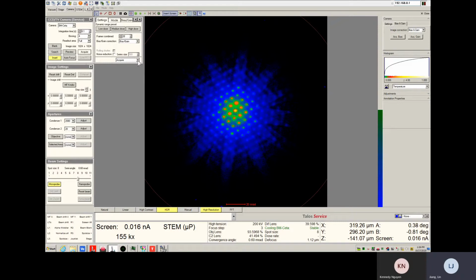So we do search first. Let's go for 0.1. Okay, then we search.